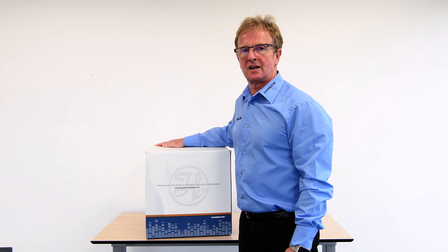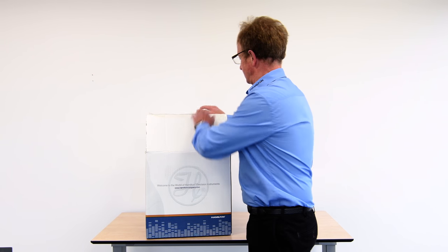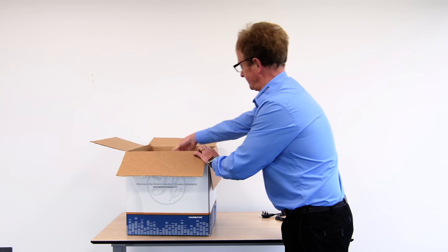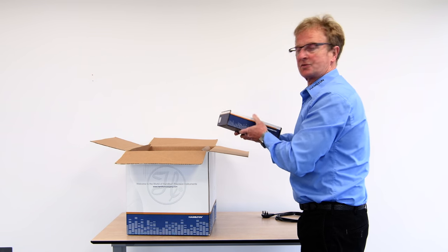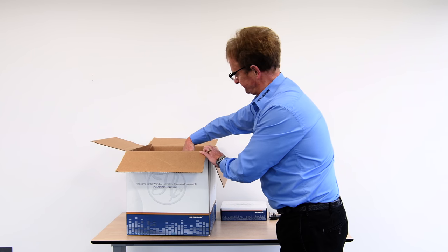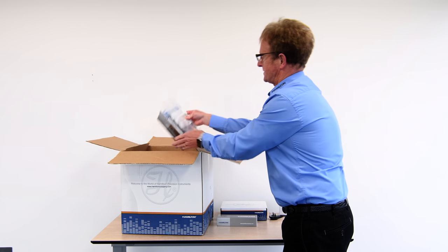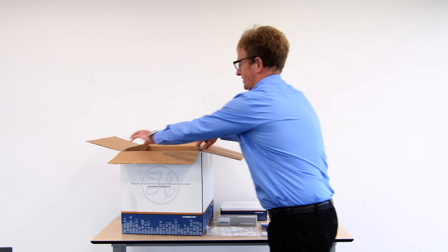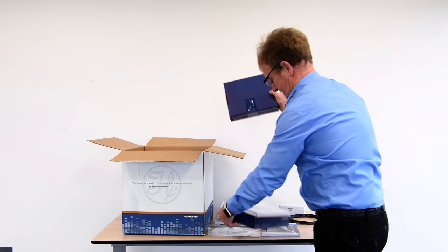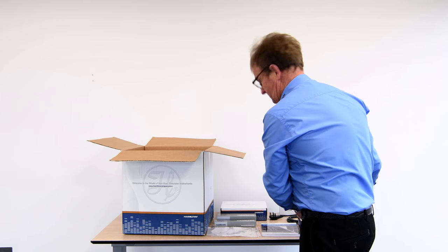What we're looking at here is the unpacking of the instrument, its component parts and how we set the instrument up in its first stage. So we're going to unpack, inclusive of the power cable, instrument headset, power converter, syringe vials, tubing lines, handbook, additional syringe, advanced applications pack, and our hand grips which we'll look at in a moment.